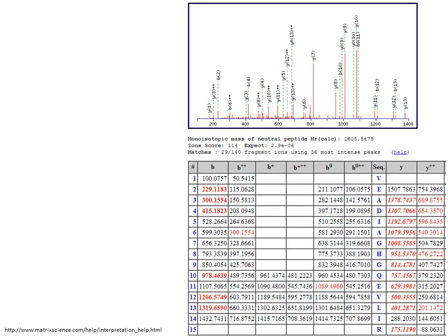So the software tries to match as many ions as possible in the peak list to the theoretical masses in the table. The theoretical peptide with the most matching masses, shown in the red text, is the most likely match. The search algorithm can calculate an ion score based on how much the table is filled in and reflects the probability that the match is not a random event.